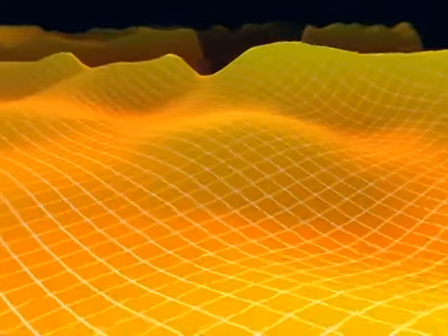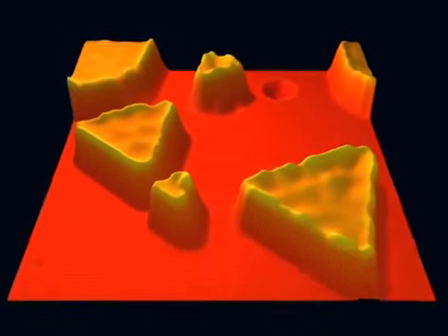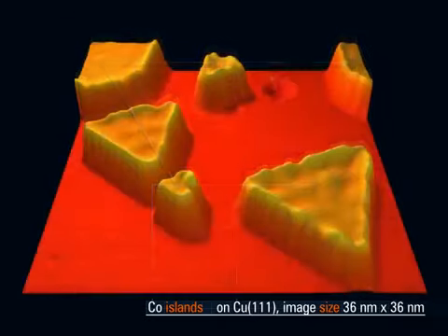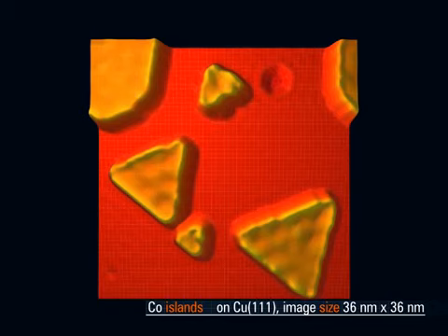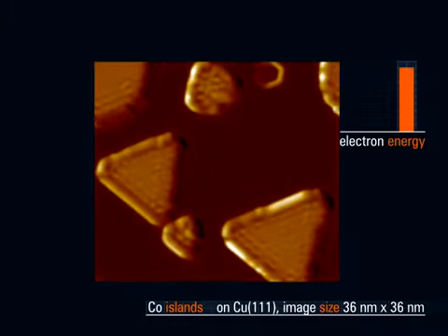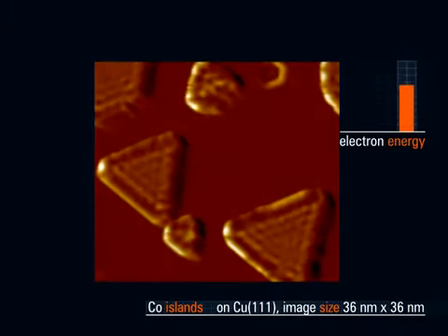Electrons can be confined within a nanostructure, where they're scattered back and forth between the boundaries of the structures. A modulation of the electron density results due to this scattering. These electron density modulations get more complex with increasing electron energy. The analysis of these patterns offers new insight into electron dynamics in nanostructures. Our results help to understand how and why the electronic properties of a nanostructure differ from those of larger size samples.